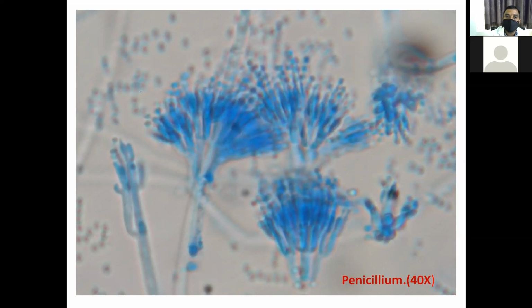Instant slide culture technique, this method. It is another method, but slide culture consumes a lot of time and requires extra equipment to prepare, so this one overcomes those obstacles. If the examiner asks, then the cellophane tape method is there.